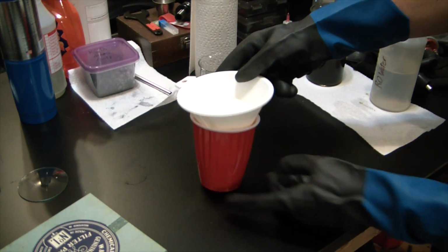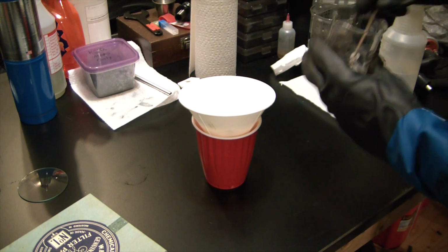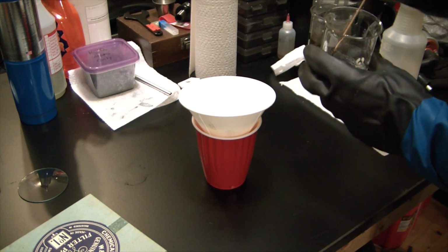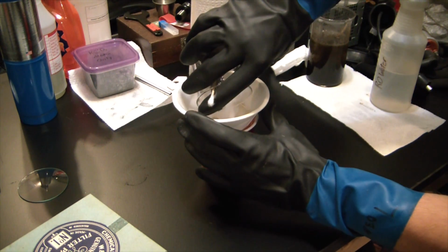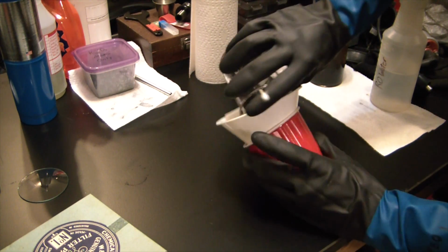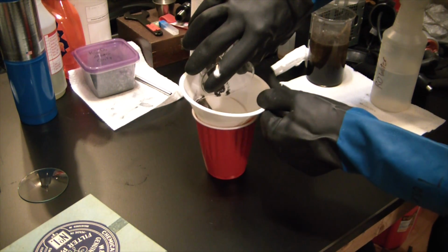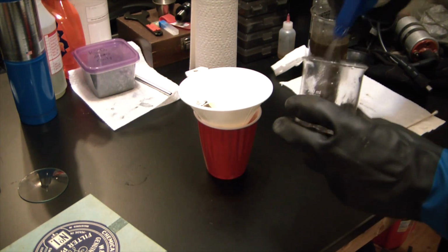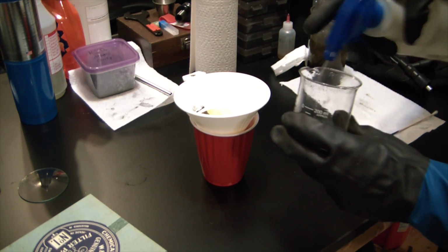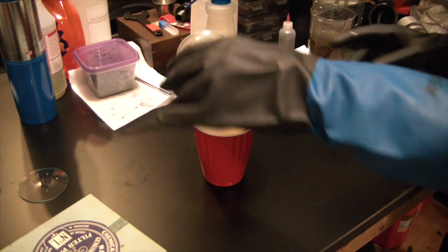So we've got our laboratory approved red solo cup filtration apparatus. And I am just going to dump the silver oxide muck right into it. Hopefully get as much out of there as possible. It was a near disaster. There we go.